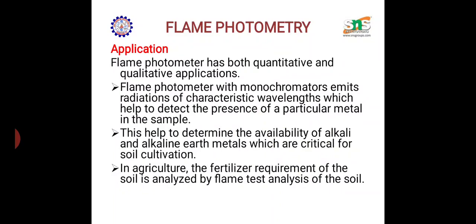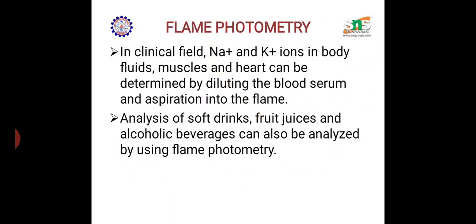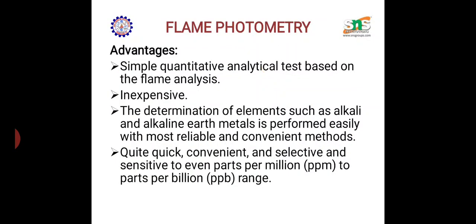You can identify the ions present in soil which are required for cultivation, for agricultural purposes, fertilizer analysis and soil testing. Clinically, we can measure sodium and potassium ions in body fluids, muscles, and blood serum, after diluting. We can also use it for soft drinks and fruit juices, to find whatever ions are present in them. So there are a lot of applications.